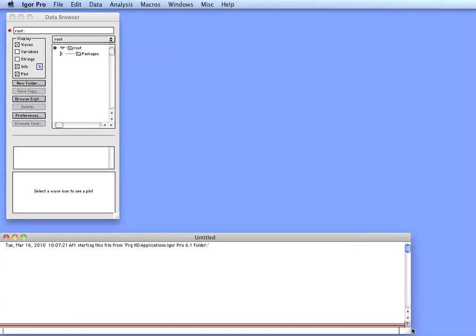This movie will show how to use IRENA size distribution tool to analyze a size distribution of powder particles. In this example, these are powders of a mixture of two alumina powders collected on a USAXS instrument. The powders were mixed from manufacturer's powders with assumed 1 micron size for the large ones and 0.05 micron size for the small ones.